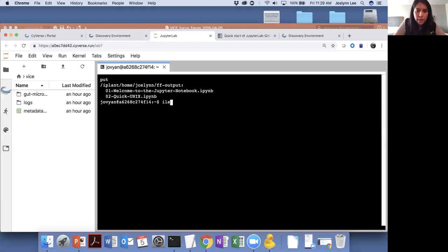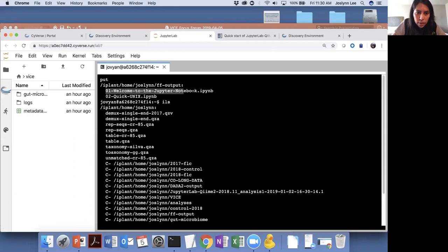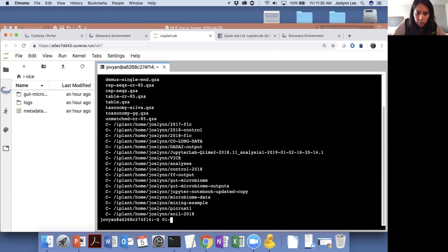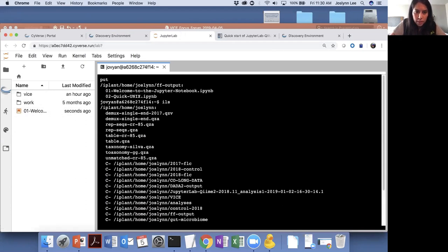That's still not the run. Okay. So I'm going to get these outputs just to show really quick of 0, 1. That's not going to work. I can copy this here. So right now I'm saying I'm going to get this from my notebook. I wonder if it's going to go. Okay. And then I wanted to get the other notebook.